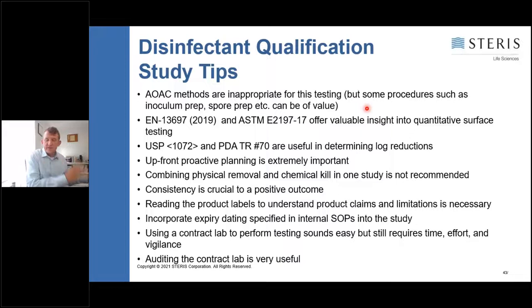AOAC methods are great methods, but they're not good for this application. They're qualitative, it's growth or no growth. You don't actually get a log reduction value truly with that method. You can still utilize that method to look at things for inoculant prep, spore prep. It's good to understand the methodology, but that's not the right choice for a validation type study. It's a supplier requirement often that's used. You're much better off looking at the methods that were designed for hard surface testing.